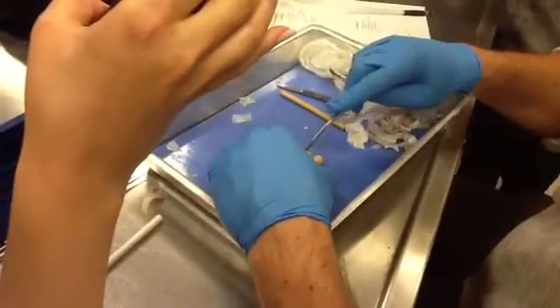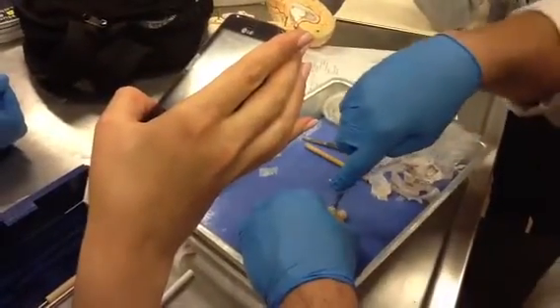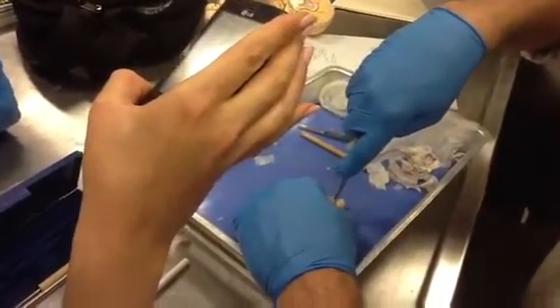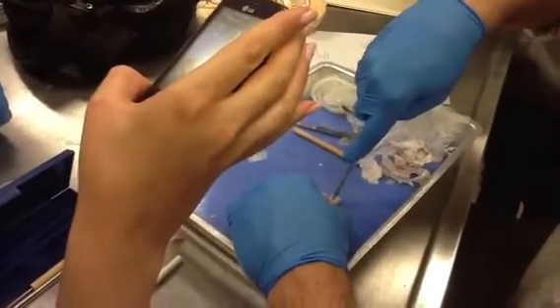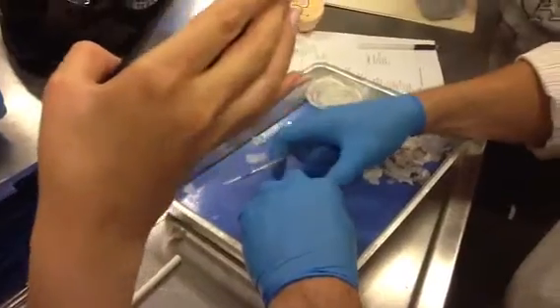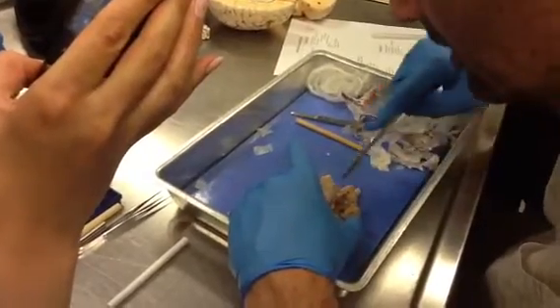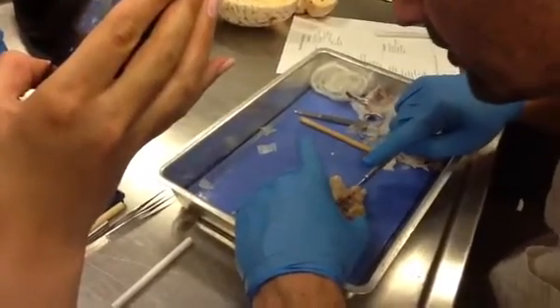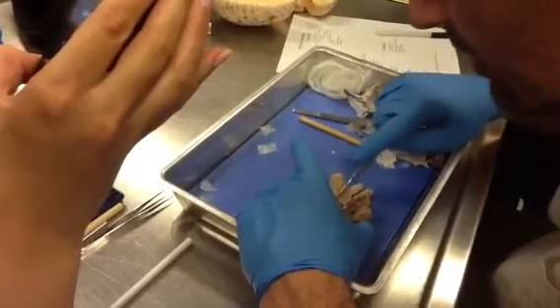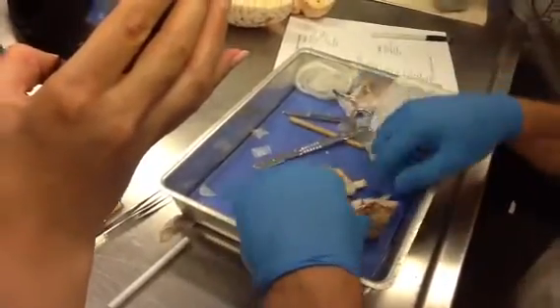So I'll just kind of squeeze it together. I go right through the middle of the vermis, and you don't have to worry too much about this. Just come down. I also stand it up, and I'll try to slide right through the middle of the brainstem and the spinal cord. Now, if I separate it, I can see I still got to cut through one little section, and I press all the way down into the, oops, see, I didn't do so great there. I went through two planes, but it's not in a very important area. Okay, and you just got to slice it into two.